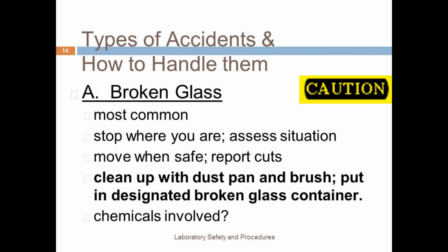We have dustpans and brushes by the vent hood to help clean up the broken glass, and all broken glass must be put in the designated broken glass container. If there were chemicals involved, you also need to report that to your teacher to make sure those are disposed of safely.